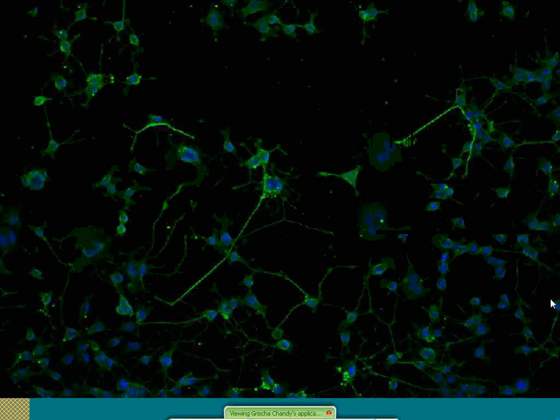So we plated cells, and then in 48 hours we treated them by changing media to galactose media and added compounds for 72 hours. So after 72 hours, we did staining, which is one step for 60 minutes, and took images immediately the same day. So actually like 5 days total. Okay.